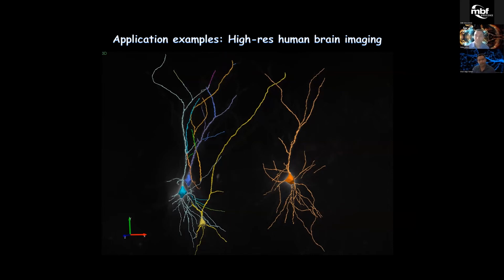Yeah, so thanks, Peter. Peter and colleagues did that. So then we can reconstruct these neurons in human brain that we have recorded from, or our collaborators have recorded from, and then try to correlate those deficits with the morphological deficit, and of course in the context of overall circuitry, where we can fill in more detail.